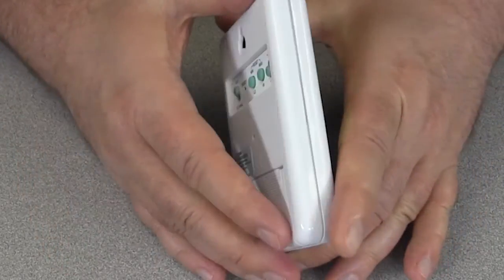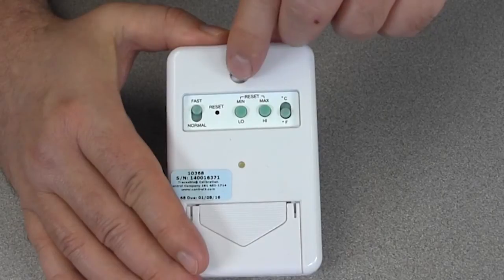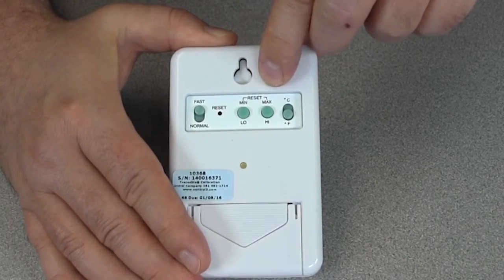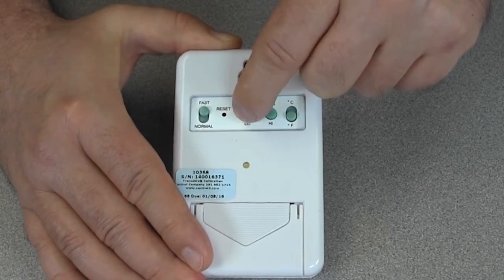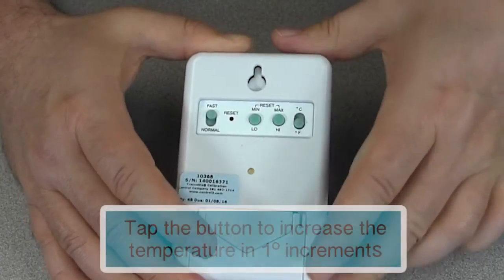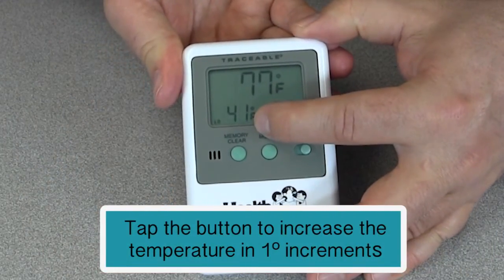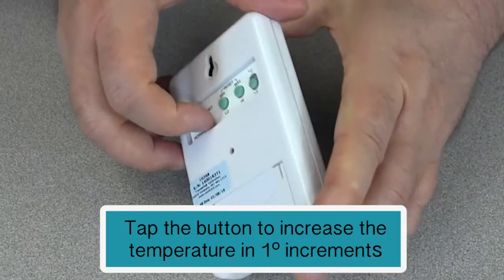We'll begin our demonstration by adjusting the low alarm settings, so we will turn the device around and you will notice there are two buttons. One button is labeled low and the other button is labeled high. If we take our finger and tap on the button labeled low, you will adjust the temperature one degree at a time. After turning the device around you will see on the display that the temperature is being increased one degree at a time.